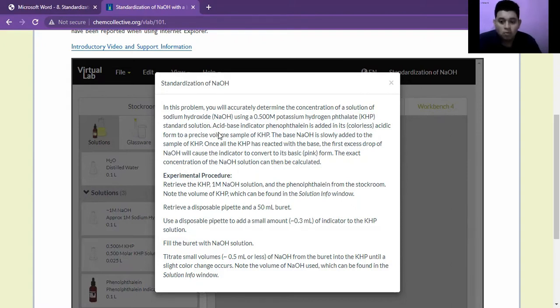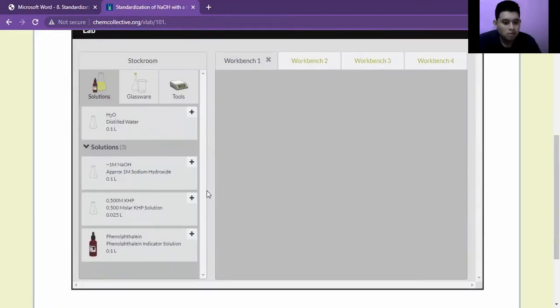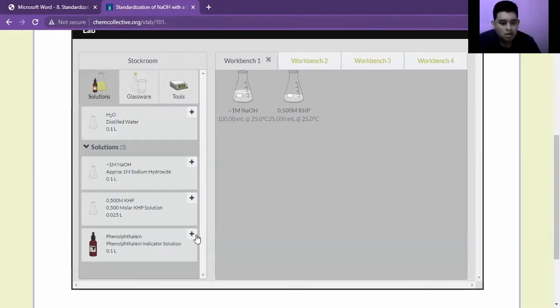The way we go about doing this is: one, we take the 1 molar NaOH, the 0.500 molar KHP, and the phenolphthalein as the indicator.